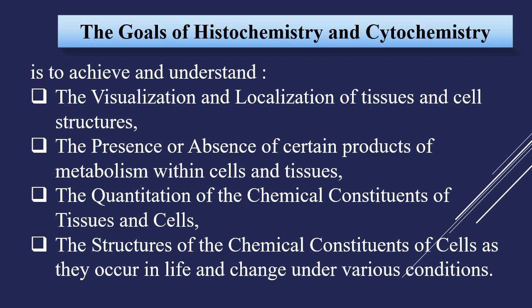You see how very important it is. Histochemistry and cytochemistry are helping us to understand the cells, how they are working, tissues, how they are working, and it's helping doctors to understand how the illness is going on or how some tumors are growing.